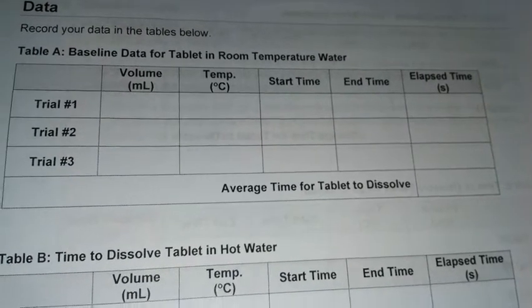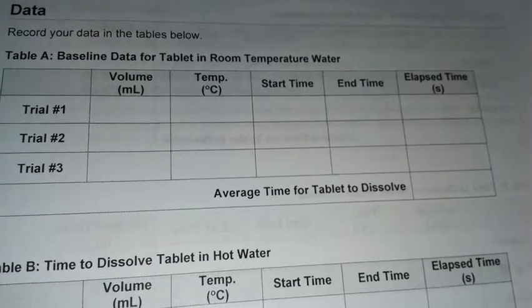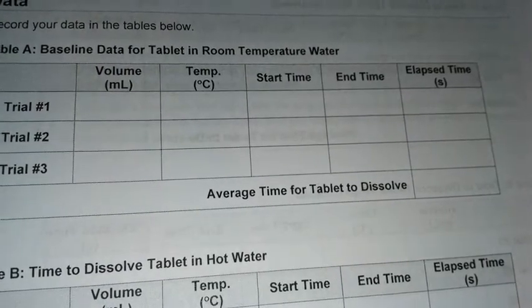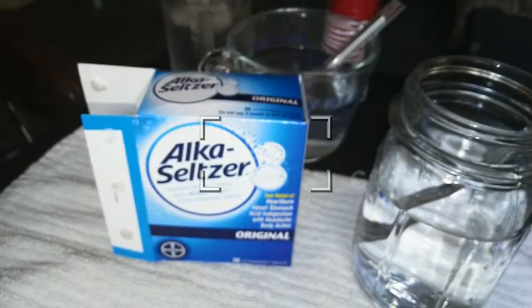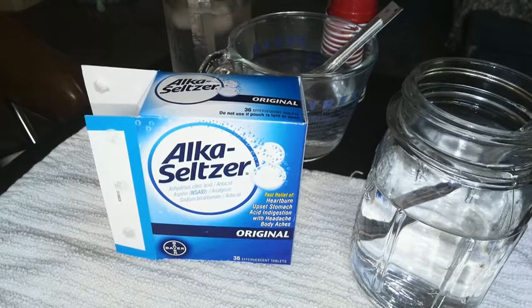But again, if you don't have the printout, that's fine too, because I feel it's just easier to have the printout. Okay. So the first thing we're going to be checking is how temperature affects your reaction. So it'll be a chemical reaction, and we have 3 different temperatures.